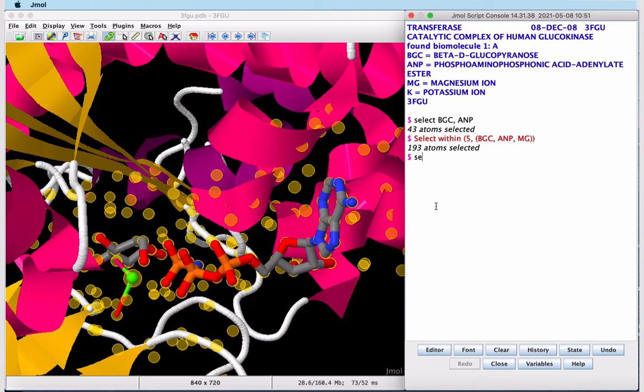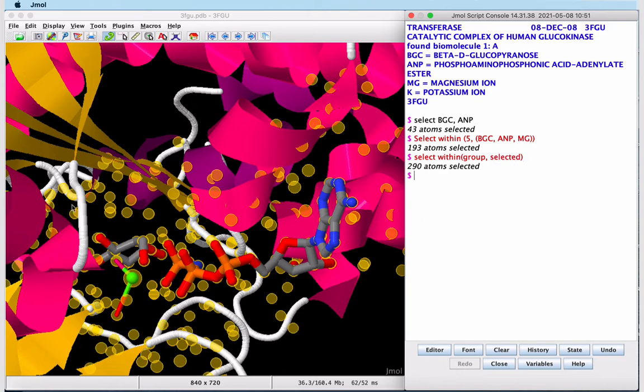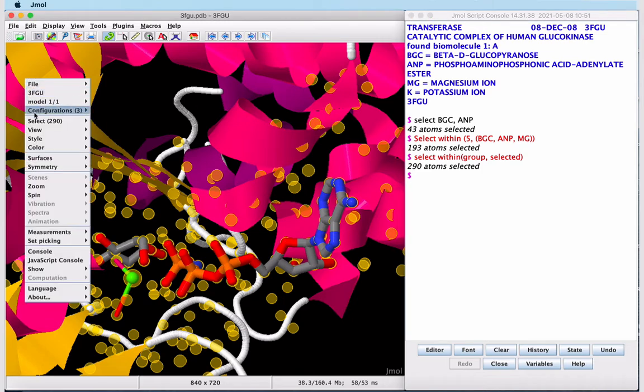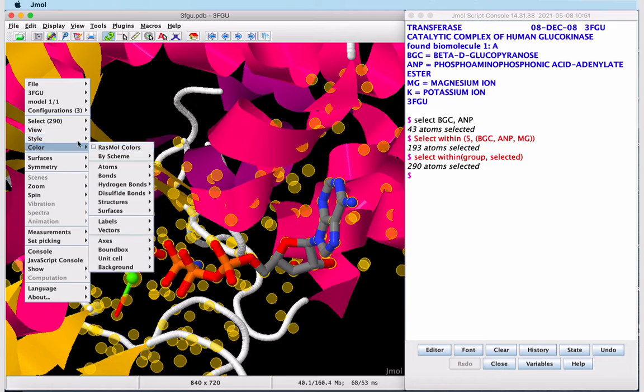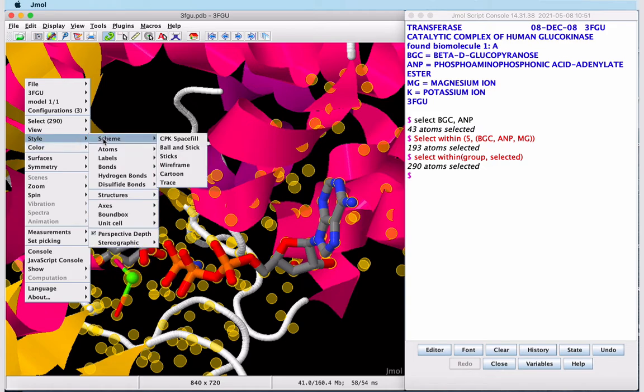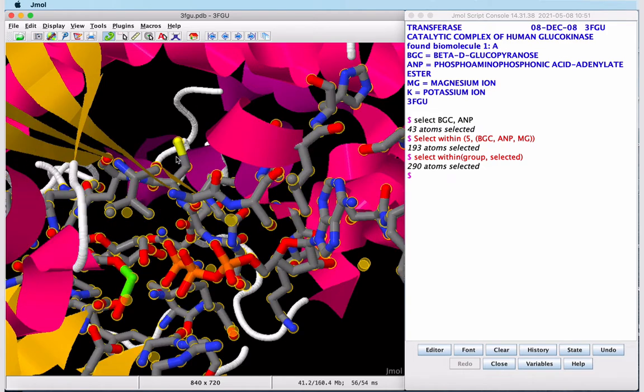Now this is selecting the atoms that are within five angstroms. To extend this to the residues, we need another command. We can see the rest of the amino acid residues light up. To display these as sticks, we can again visit our pop-up menu, Style, Scheme, Sticks. And now we have everything in the active site displayed as sticks.